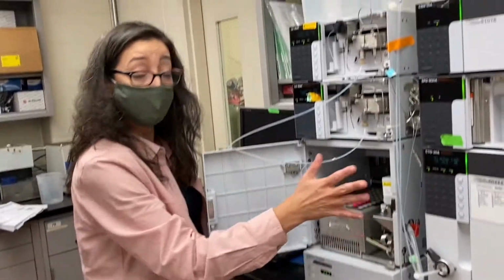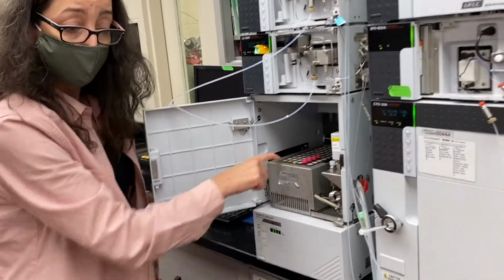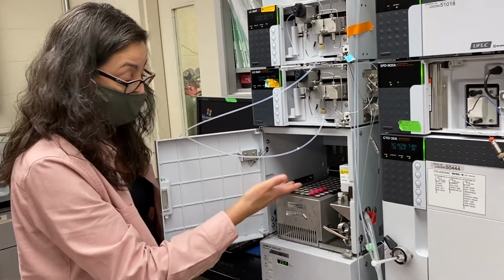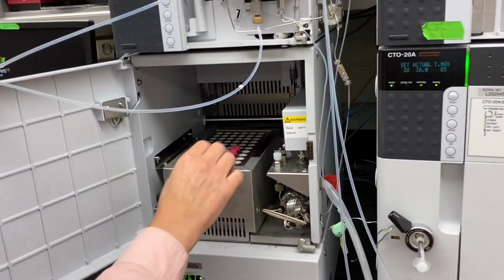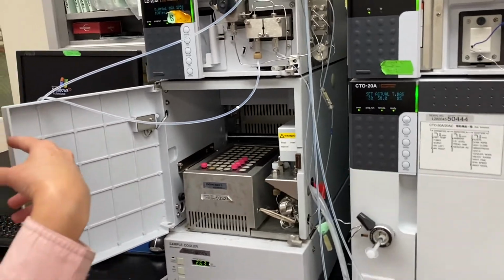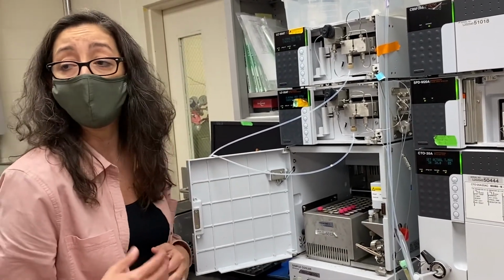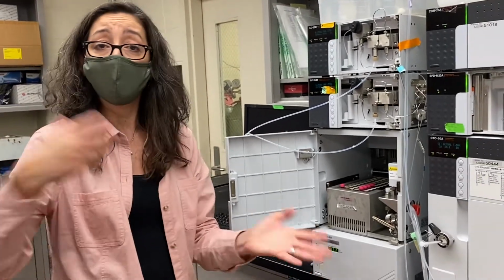So we have, this is an auto sampler. So we have our samples. There was a sample here. Okay. So in this case, we have our T sample. We put it here, and then you will have the rest of your samples with your 4 replications. And then we have our standard. So basically we can fill 50 samples, program the unit, and then we have auto injection, and it just goes into sequence and collects the data. So in HPLC, if you have an automated system, you just program it, leave, and come back and get the data.